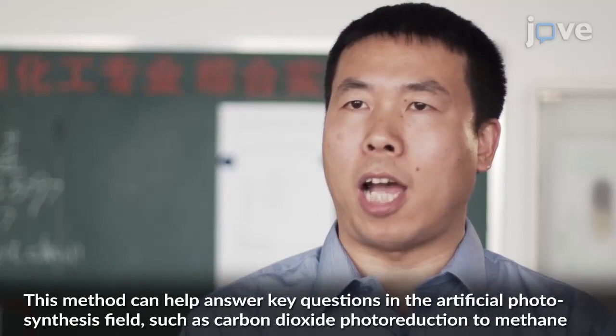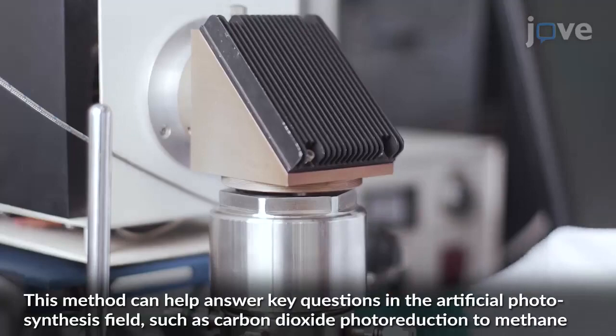This method can help answer key questions in the artificial photosynthesis field, such as the carbon dioxide photoreduction to methane.